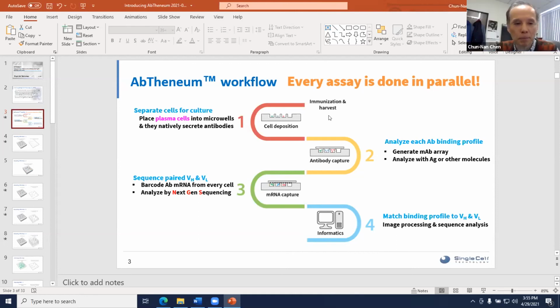Right. Colby Salters asked, what percent of the plasma cells end up secreting IgG? Oh, that's a very good question. It depends. Right now, with the CD138 markers, the percentage varies a lot.